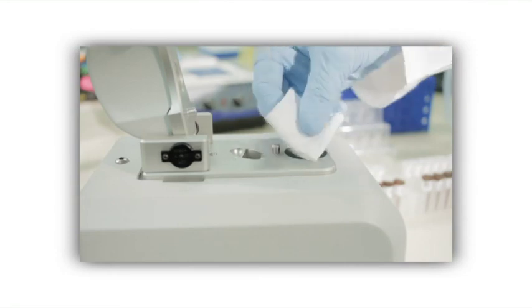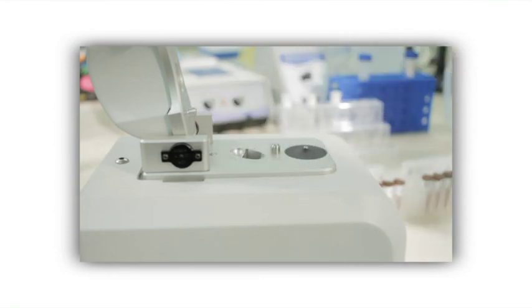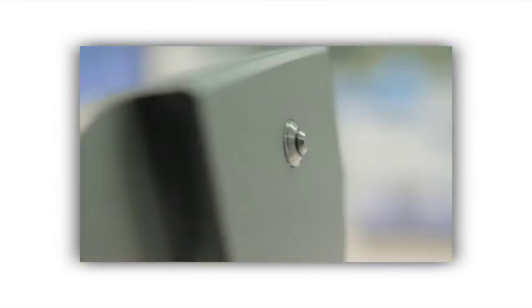Furthermore, the Sample Retention System expedites the experimental process with a fast cleanup, which consists of simply wiping the optical surfaces with a laboratory wipe.